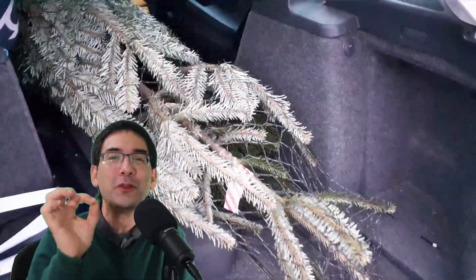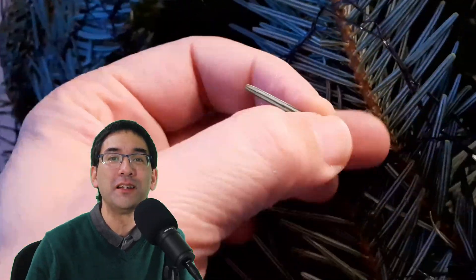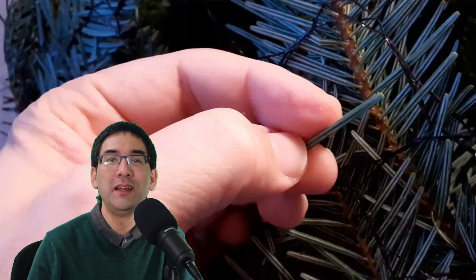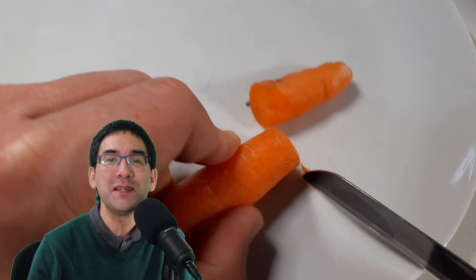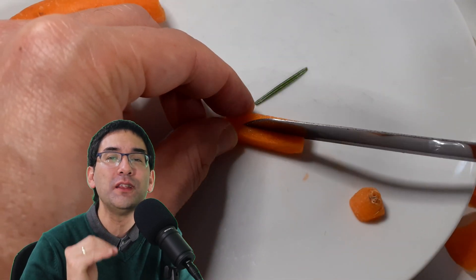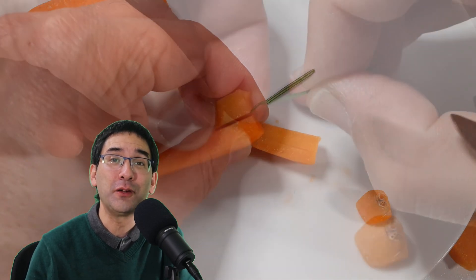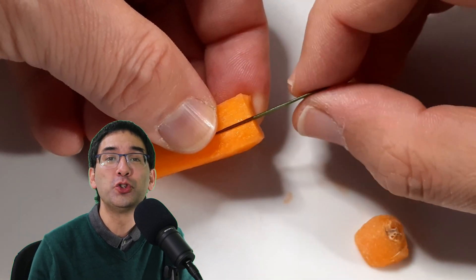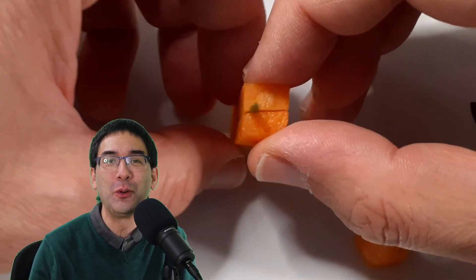Back at home I immediately plucked one of those needles off and started to prepare it. I began to microtome it, and in order to do that I needed a carrot as a specimen holder, because I wanted to cut it into very, very thin sections to put under the microscope. I'll also show you a couple of tricks I used to improve the image quality.